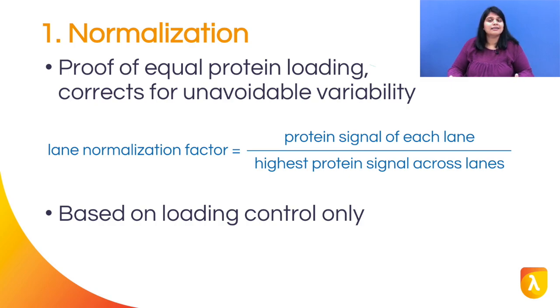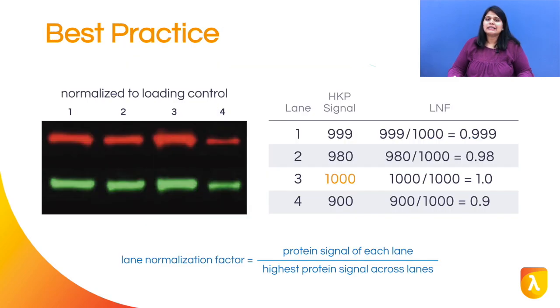loading per lane. More information on how to select a normalization strategy can be found in the normalization course here at Lambda U. Now, let's see how to calculate the Lane Normalization Factor.